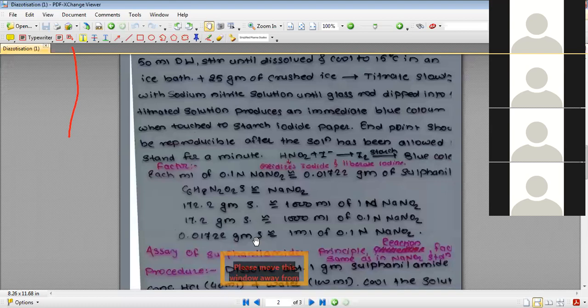Drugs containing a nitro group can be reduced to an aromatic amino group by using a reducing agent. By applying reduction, we can convert the nitro group into a primary aromatic amine and find out its content.